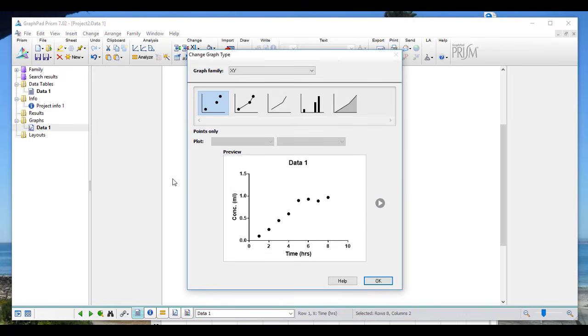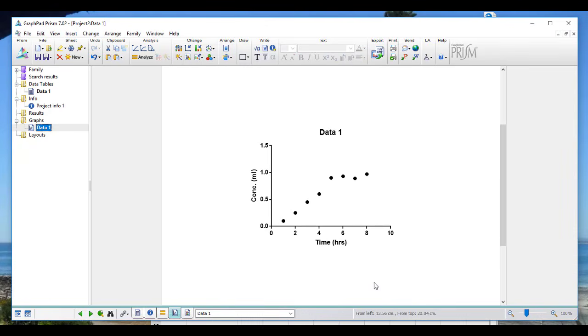The pop-up graph gives us a few different choices on how you want your graph to look. In all of the cases for graphing this semester, you'll be creating a scatter plot and inserting a line of best fit or trend line. The line of best fit is not always linear. In fact, in most of the experiments that you will be doing, the correlation between the 2 variables will not be linear. And in no cases will you be creating a join the dots type graph, so be warned. So scatter plot is what you want, so click OK.